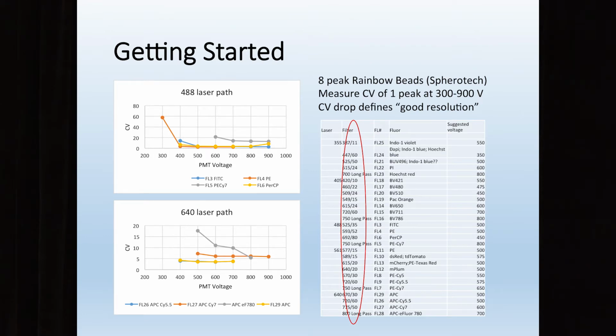maybe even 9 months, we worked with those voltages, and we'd find some were really off and just didn't work. We'd make a little note, scribble it down, look at the compensation as we did things for people, and we just kind of flew by the seat of our pants, because that was the best we could do. But we got it working pretty well.